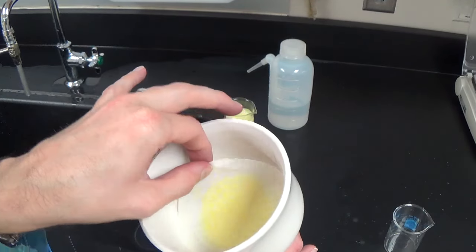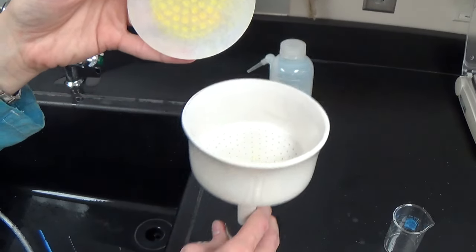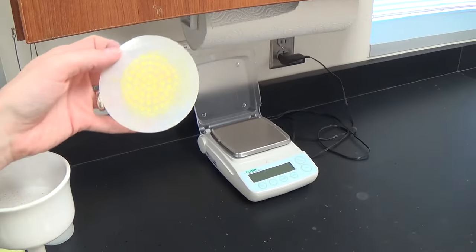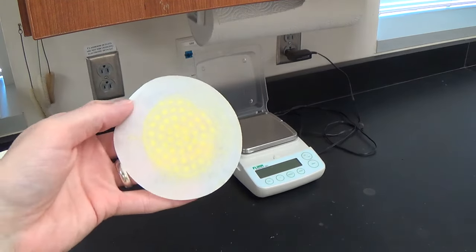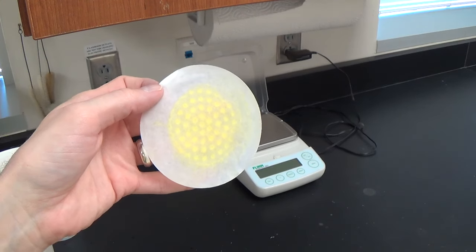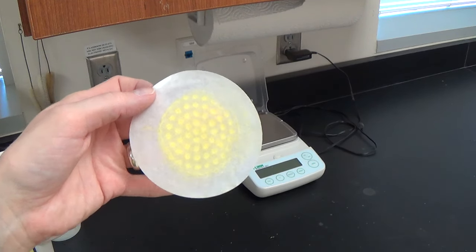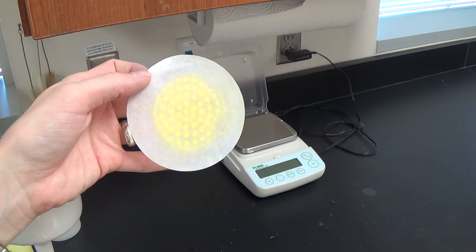I need the mass of the precipitate, which means I need the mass of the filter paper and precipitate. Easy enough to do, right? Just put it over here on the balance and get the mass. Oh wait, no. What also is on this paper? It's filter paper, precipitate, and water. There is moisture still on this paper. So what do we need to do to this paper before we can find our final mass? We need to let it dry.